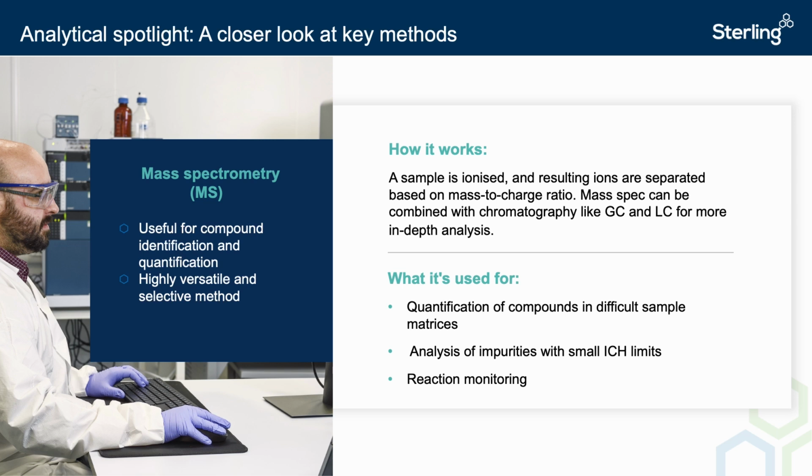As the solvent evaporates, the sample ions are driven closer together and directed into an ion transfer tube and lens structure. The ions observed are created by the addition or removal of a proton or other common adduct. It's also possible to observe multiple charge states, especially in large molecules.